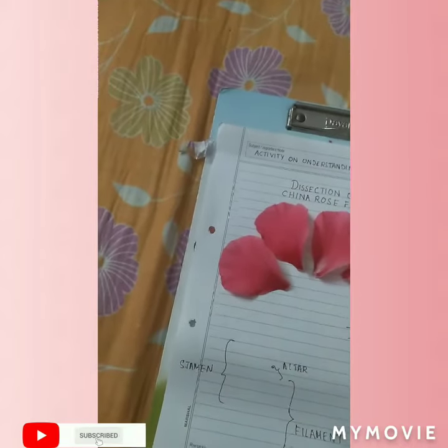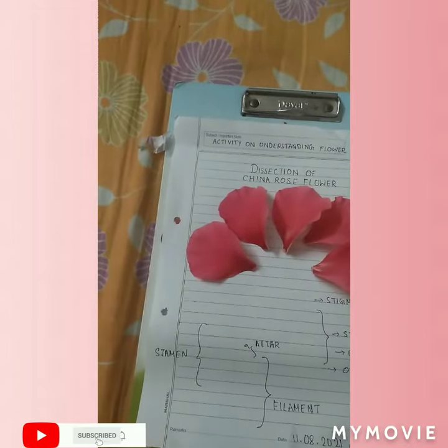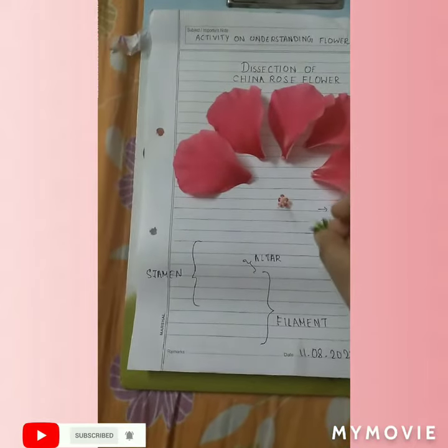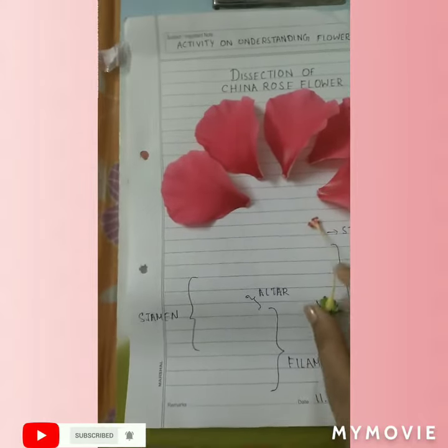Wait, sorry, displacement. So let me keep it in placement. Yes, now it's correct. You can see the different petals. I have made it in a semicircle way. Now I'm going to place these parts.